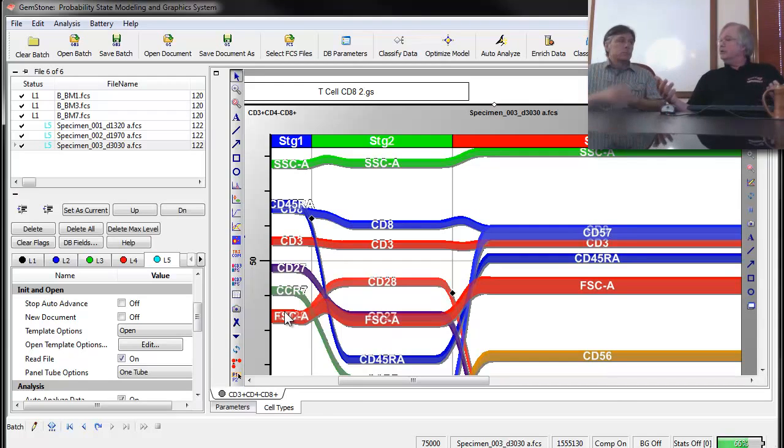So that's pretty much it. The first tutorial was in many ways the hard one because we need to make it so that the selection is very robust. But once we had that template model, it was relatively easy for us to add the staging markers to it and add modeling to the system.